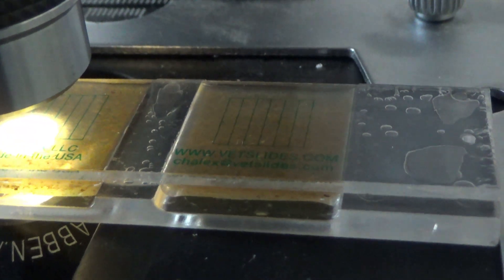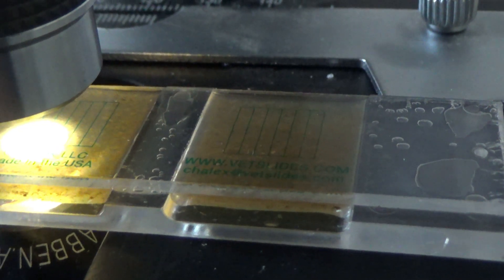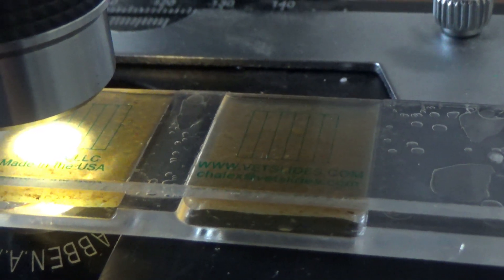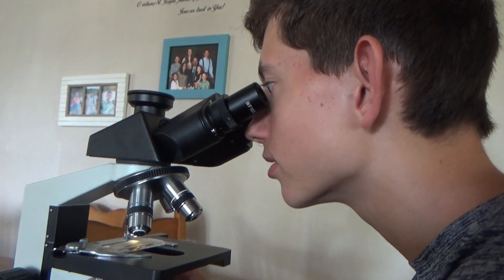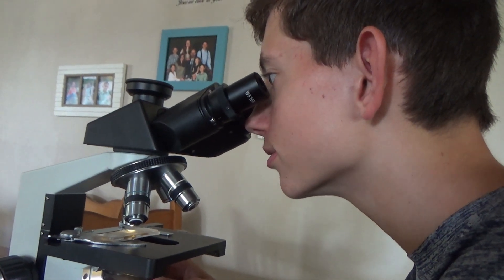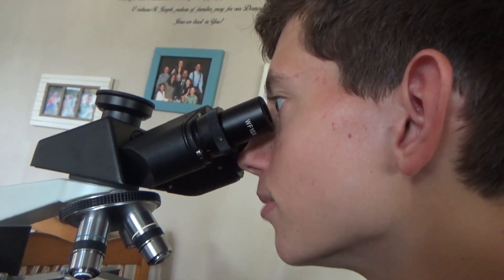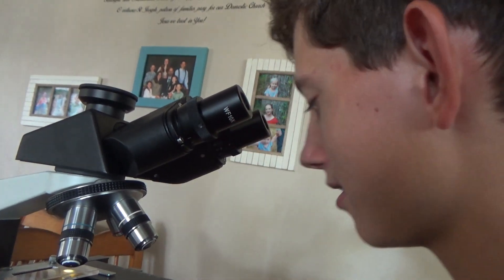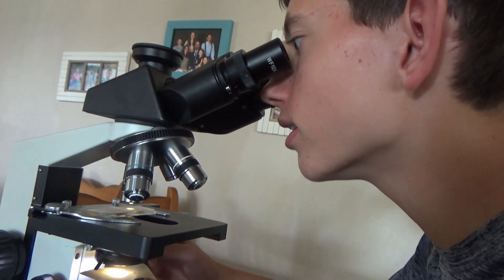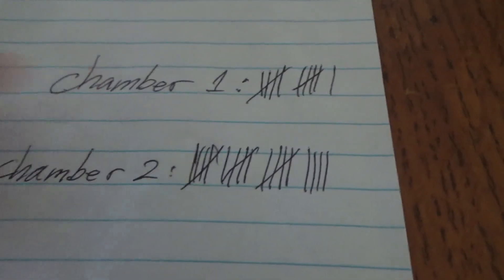Based on the count, if the number is under 1,000 and the goat is really healthy and has a good FAMACHA score, you might not need to deworm them. But if it's above 1,000, you're probably most likely going to need to deworm that goat. In chamber 1 I found 11 eggs and in chamber 2 I found 19. We'll add those up: 11 and 19 is 30, and we'll multiply that by 50 to get 1,500 eggs per gram.